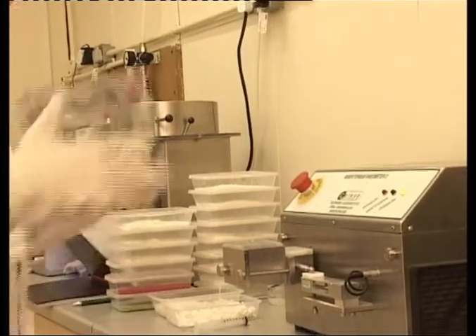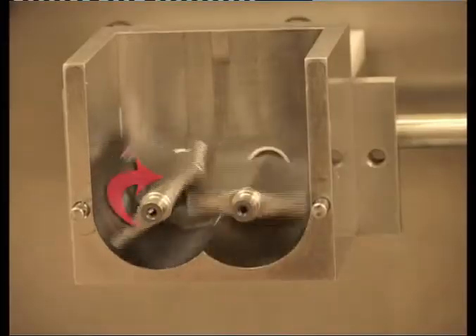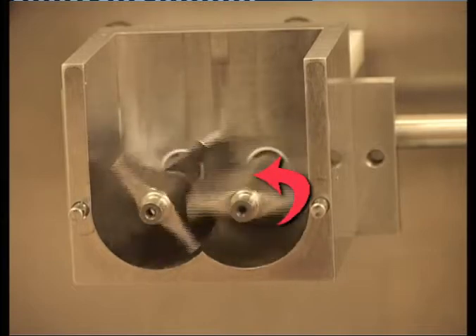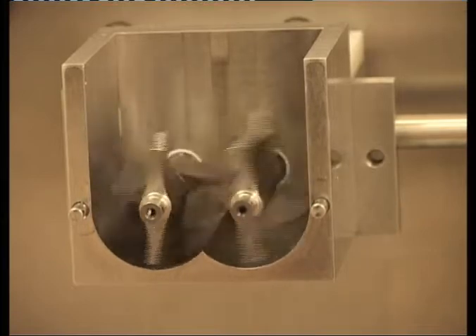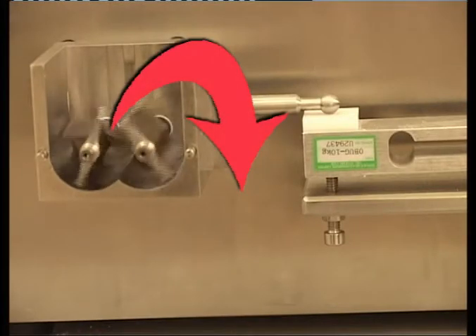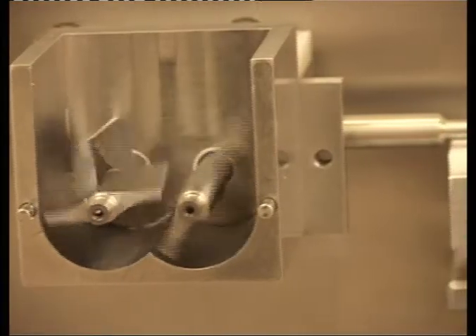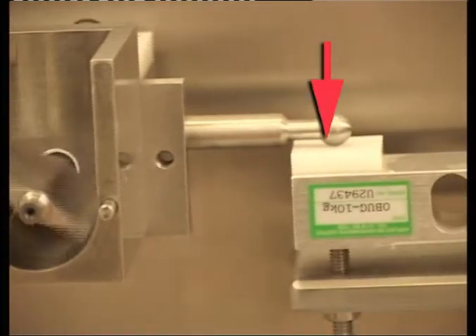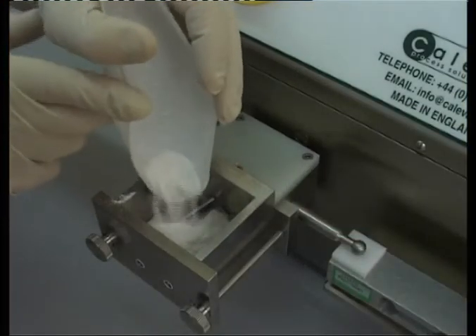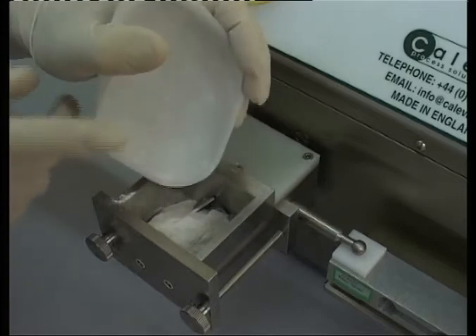The mixer torque rheometer, MTR, comprises a mixing bowl containing two horizontal contra-rotating mixing blades. The secondary blade rotates at twice the speed of the primary blade. Since the bowl pivots about the primary drive shaft, the action of mixing a wet powder mass generates a torque, which is detected via a torque arm by a load cell. The torque generated is directly related to the consistency of the wet powder mass in the bowl.